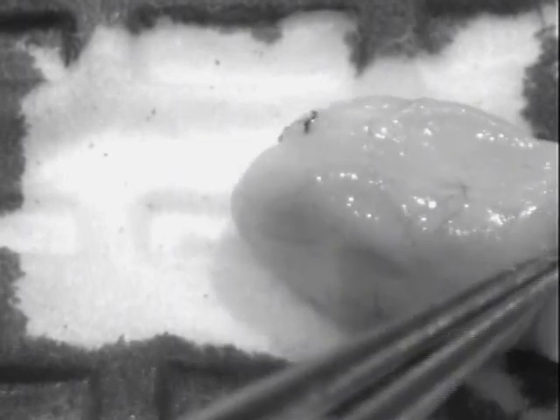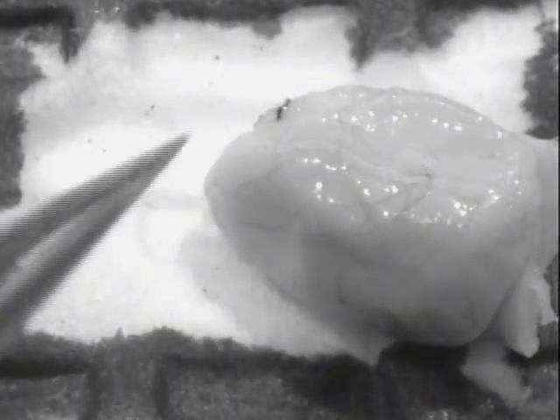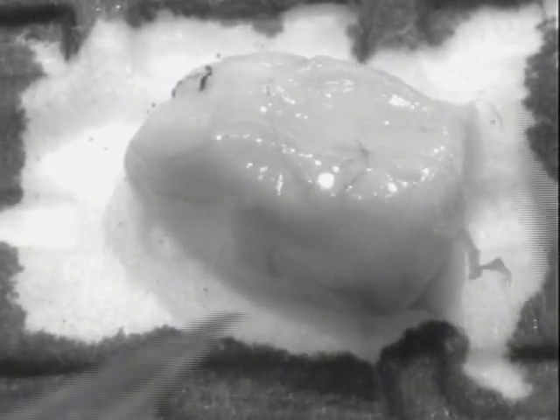This brain has been fixed in RNA later, so it's a little bit brittle and a little dehydrated — kind of raisin-shaped. But that actually makes it very easy to dissect for today.